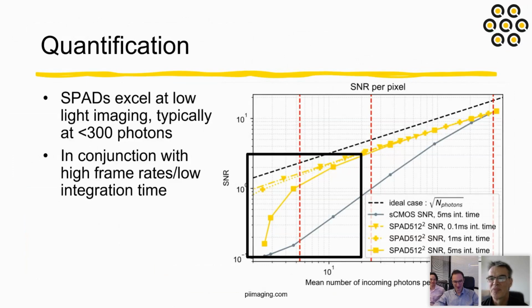Excellent. Can you expand a little bit on what the limiting frame rate was when you showed your FLIM data? You gave a frame rate of 30. Yes. Finally, the frame rate is defined by the lifetime precision that you want to have. So if we are slower, we are going to accumulate more photons, and then our precision will be higher. This is the main limitation.